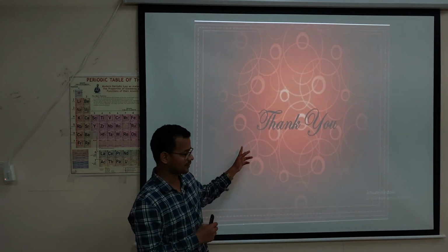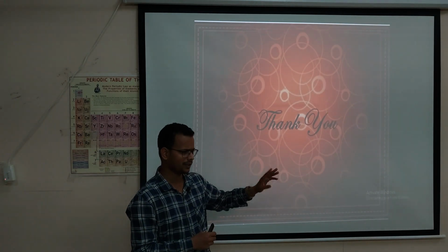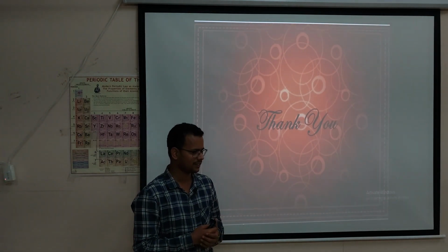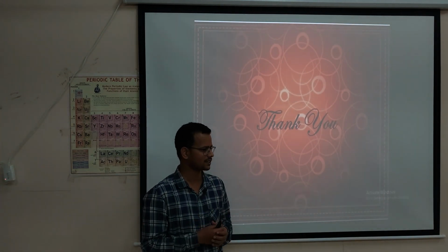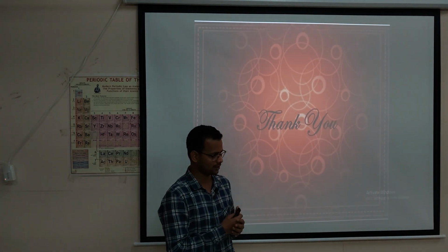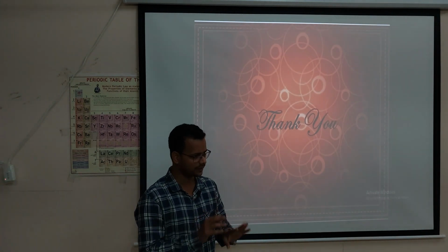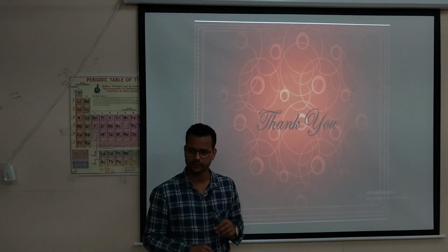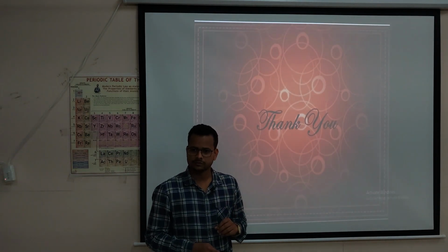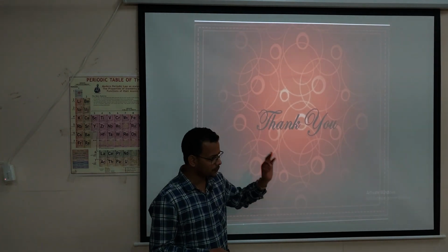So in that case, in that class I will explain how to calculate band gap, indirect, direct. So I will finish it. If you have any doubt, you can ask, because this is the only class for your UV visible. Later we will discuss, but if you have any doubt, you can ask. Sorry, Pratiksha, you are late. Today's uncompleted part we will discuss. That last slide was the only important slide for today.